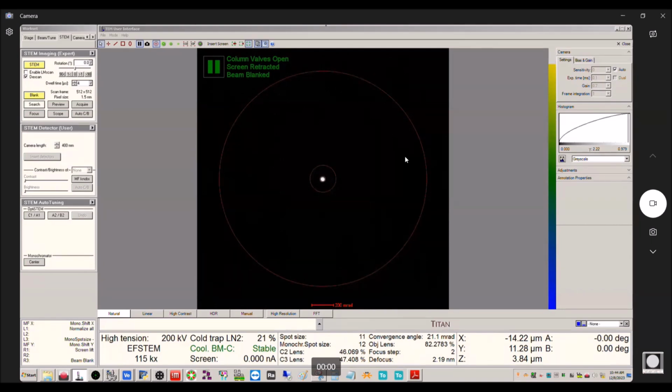All right, so we're seeing the microscope interface now. So here is the D-scan right here in the STEM panel. Okay, so it's just this guy. Want to make sure it's checked. Okay, and that's basically, yep, that's a crash course in monochromated STEM-EELS.